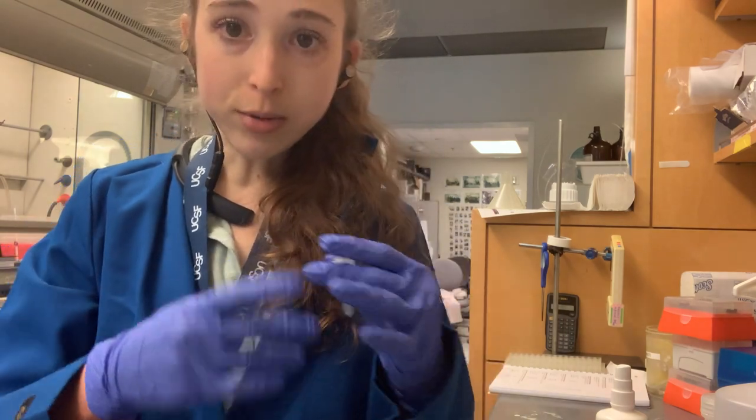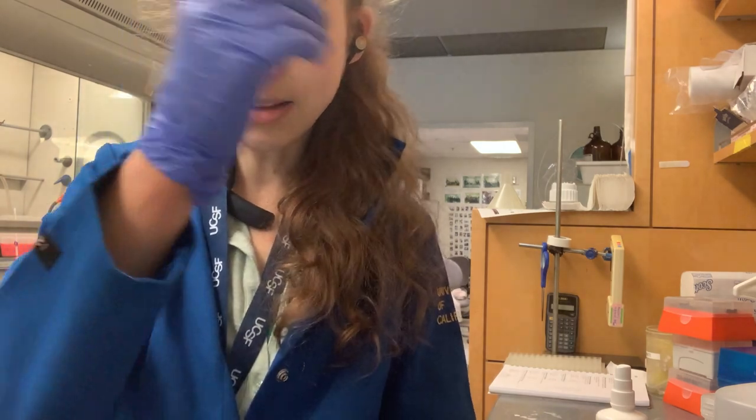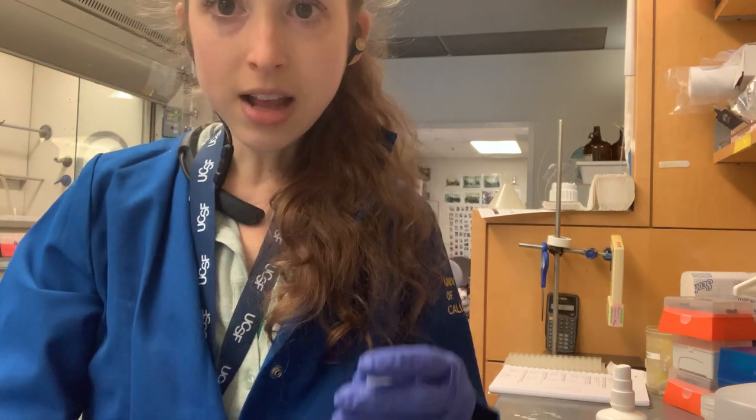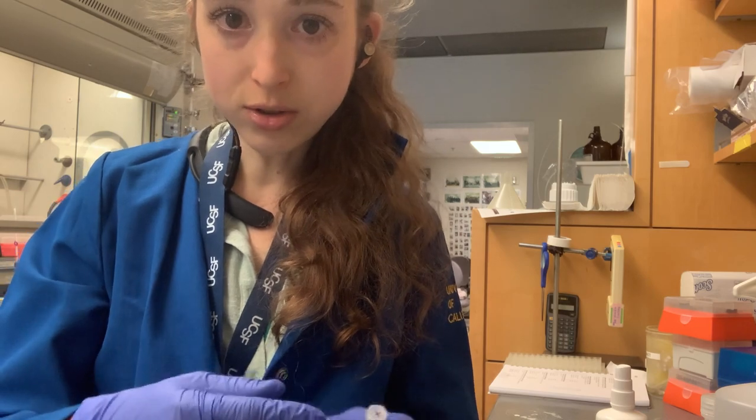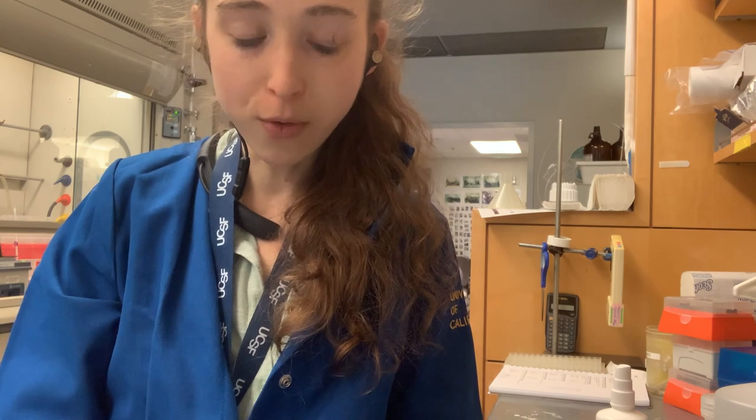It's nice if you can label your tubes and then stick them in the ice, pre-cool them a little, and then put your sample in. Another thing is that when you're trying to label tubes that are already on ice, they get cold and you have that whole condensation problem.